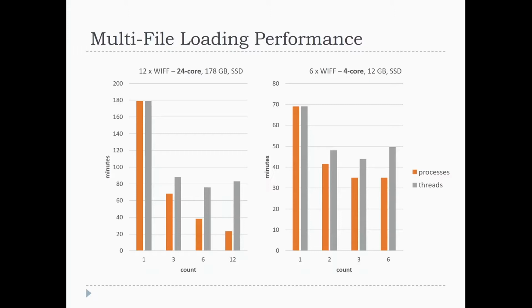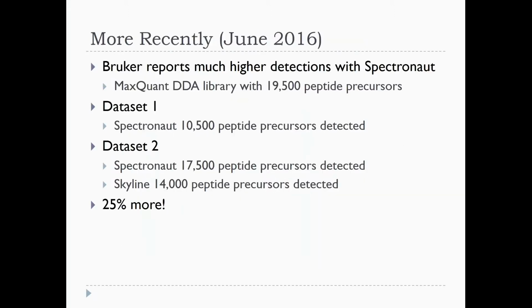So in the user interface, you're sort of limited to this degradation, and you can get almost a 50% speed up. This is a normal dev computer. This is a normal 4-core i7 computer. But yeah, we did a lot of exploration of performance.